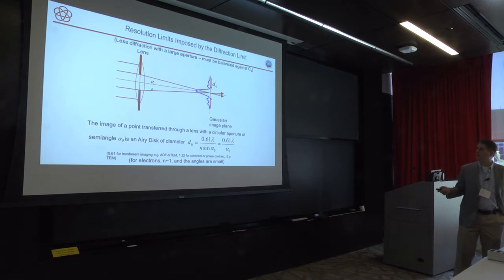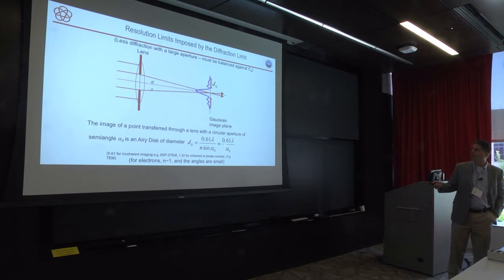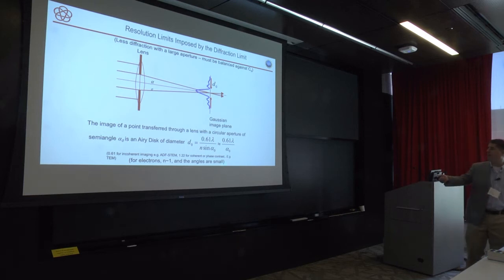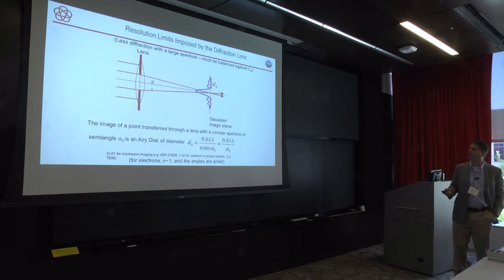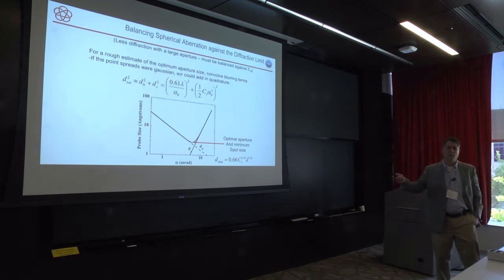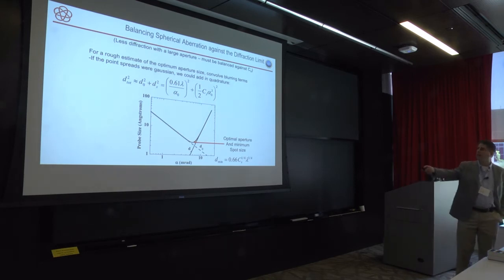And for most systems, because I need beam current in the system, I'm source size limited, and so the numerical prefactor here is usually the numerical prefactor of the source size, not that of the intrinsic Airy disk. They both scale the same way, they both need large aperture sizes. And I can't get a large aperture size because of my aberrations. So here I am just analytically, rather than doing a proper wave propagation, adding these up in quadrature. It gets you the right scaling, it gets you the wrong prefactor.